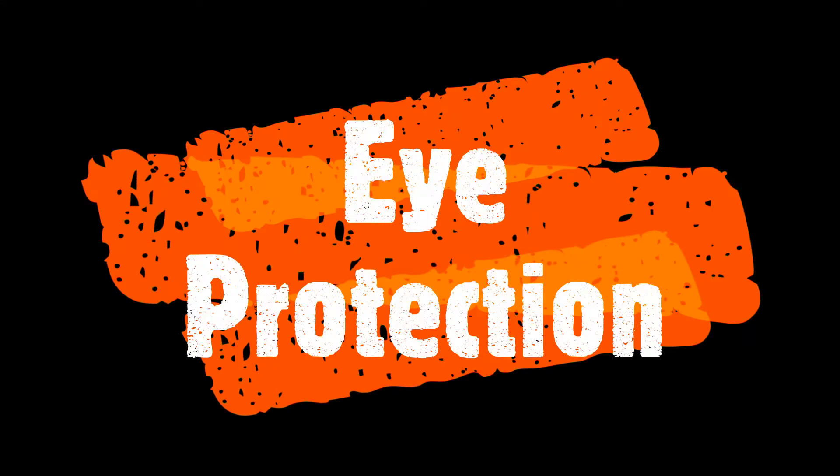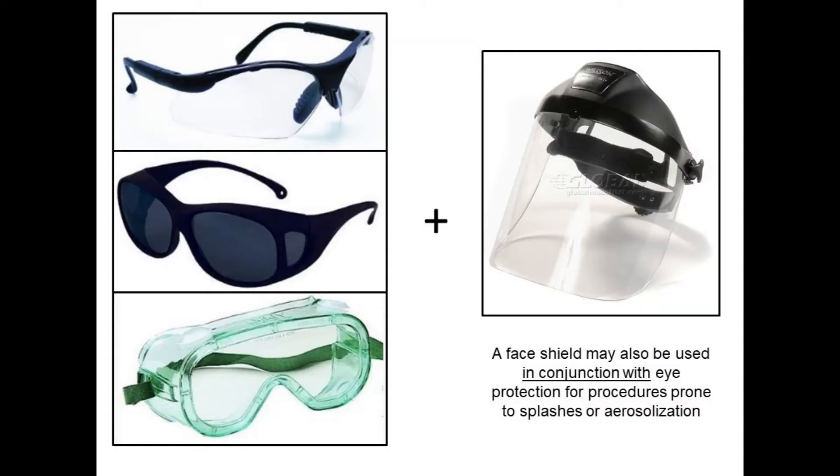Now let's talk about eye protection. Safety glasses should be ANSI certified against the hazards you work with, including UV, laser, or impact. Also choose appropriate eye protection in the form of safety glasses, OTGs — or over the glasses glasses — or splash goggles. If you ever need to use a face shield for particularly messy or hazardous substances, make sure you use eye protection and a face shield together. Always remove eye protection using the ear pieces or the headband.